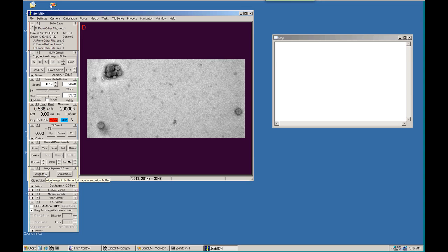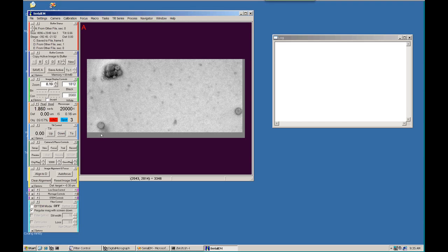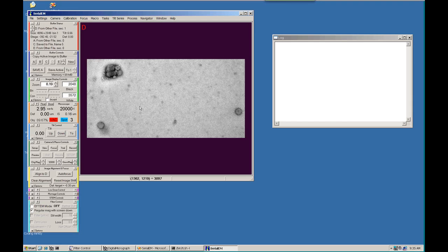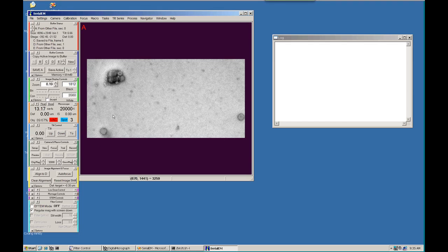Starting with zero image shift — notice the image shift is now zero. If you push Align to D, it shifts the two images into alignment. Toggling between them, they're now nicely aligned. It also imposes image shift on the microscope so that the next picture taken will be at the place you've aligned to. If you clear the alignment, it goes back and removes that image shift at the same time.